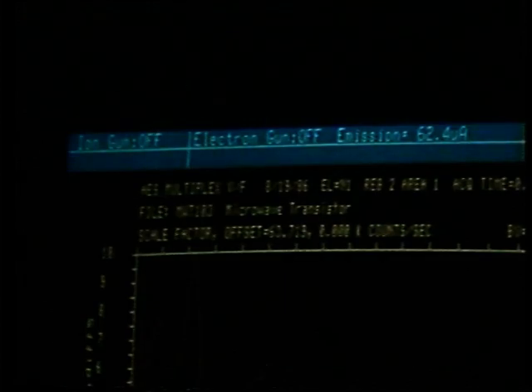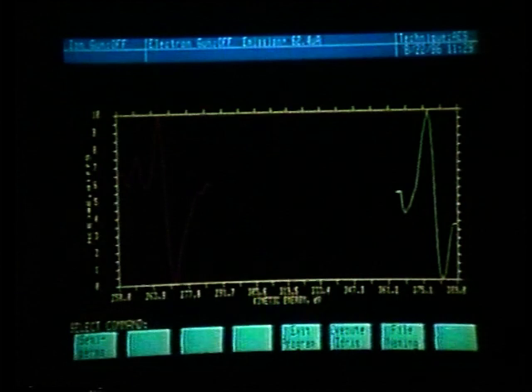Let's toggle the graphics labeling off by holding the Shift key and pressing function key number 14. Let's also clear the screen by holding the control key and clear. And let's re-enter the multiplex display menu by holding the Shift key and pressing function key 15.